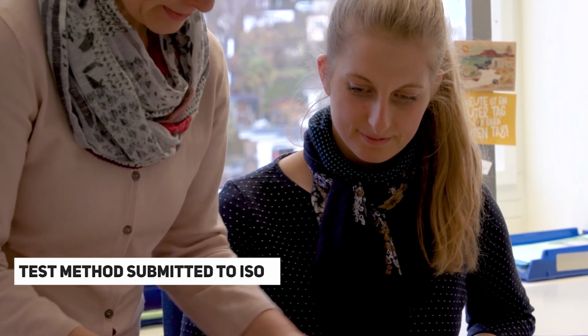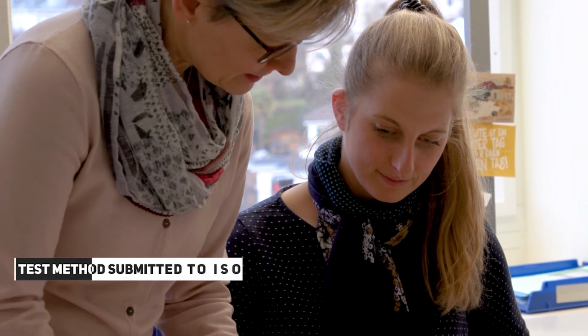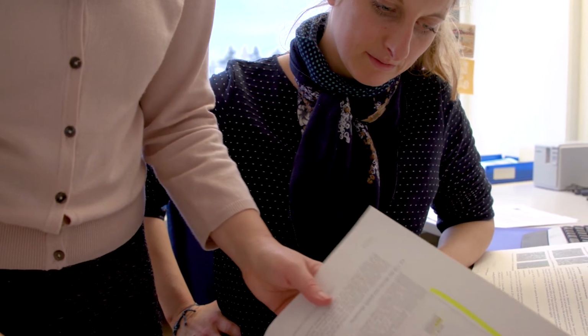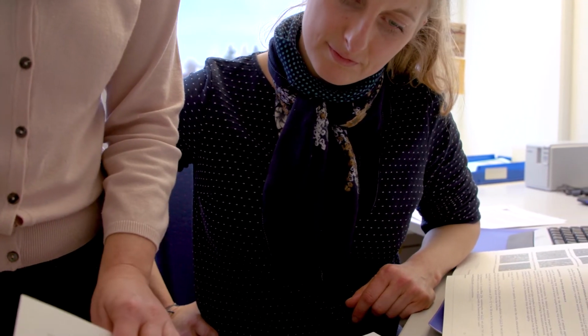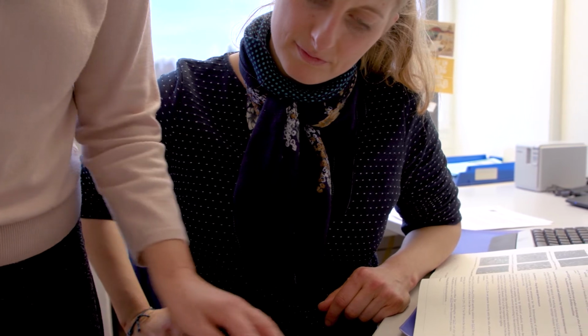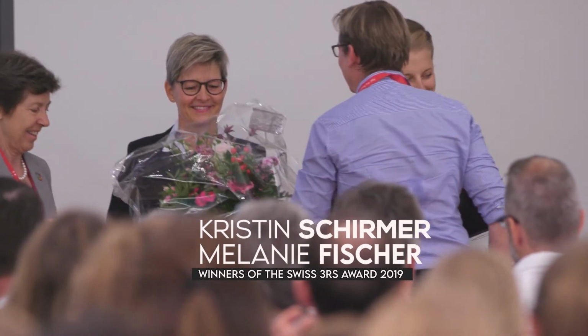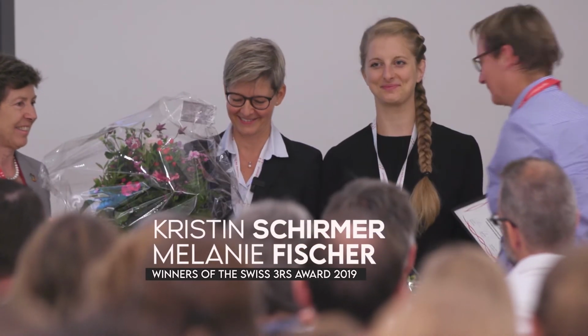Now we did this in 2014, and it took quite some steps to further improve the method, respond to comments and concerns, and I'm very honored and happy that Eawag actually supports this type of activity, because it's no longer basic research, it's really transfer into society. And so then last year in 2019, our method was finally approved. It got the quality label of ISO. It's the first method ever to use a fish cell line with ISO.